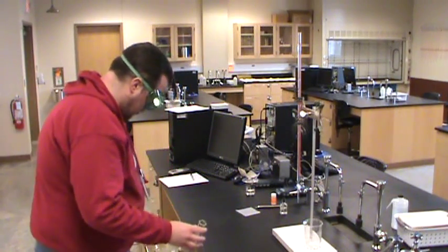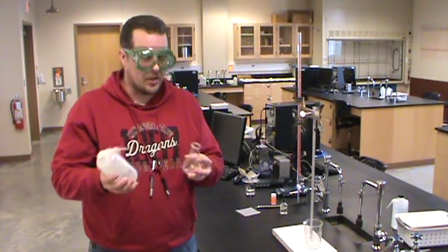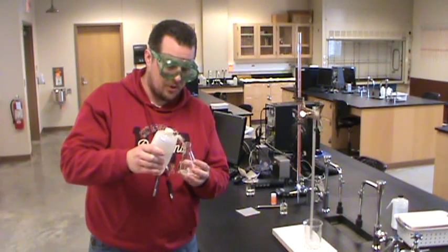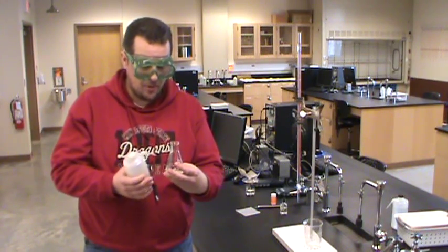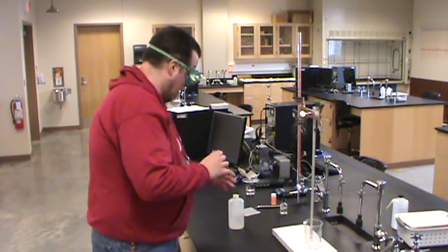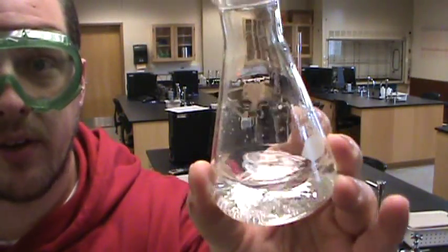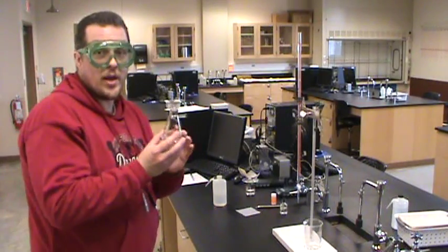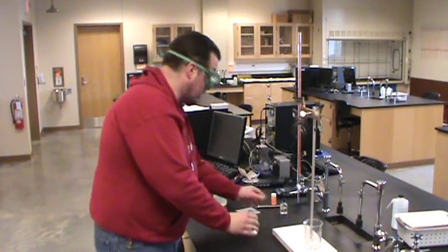All right, now, the procedure says add about 30 milliliters of water. The actual volume really isn't important because I know how many grams of KHP I've put in there, so I know how many moles of potassium hydrogen phthalate are present. So I added some water to that, and if you look a little bit closer, you can see that it didn't all quite dissolve yet. That's okay, because as we do the titration, as this reacts, it'll continue to dissolve.